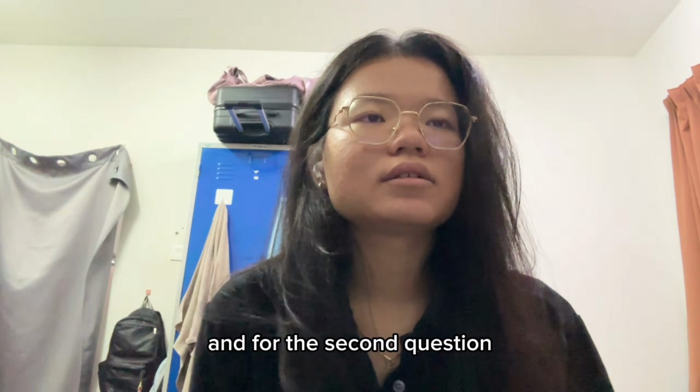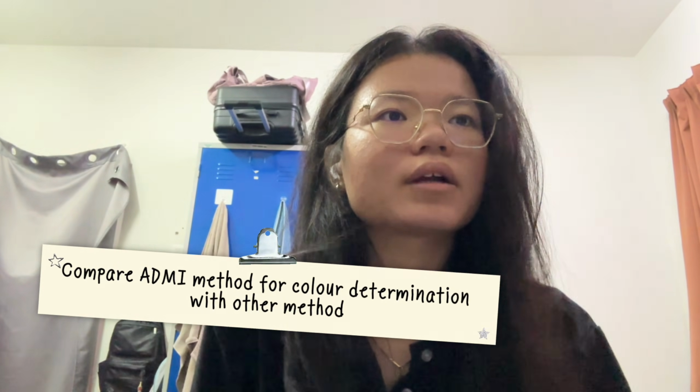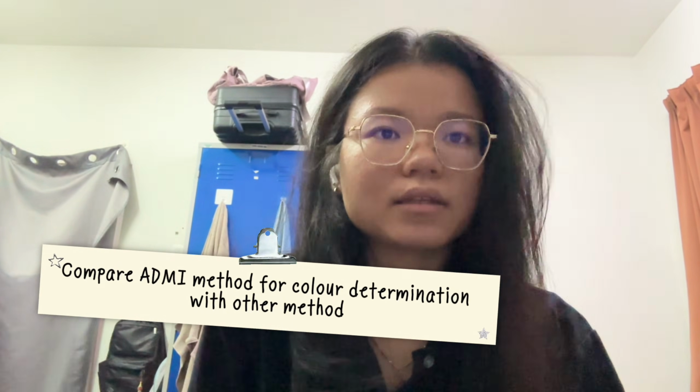And for the second question, compare the ADMI method for color determination with other methods.